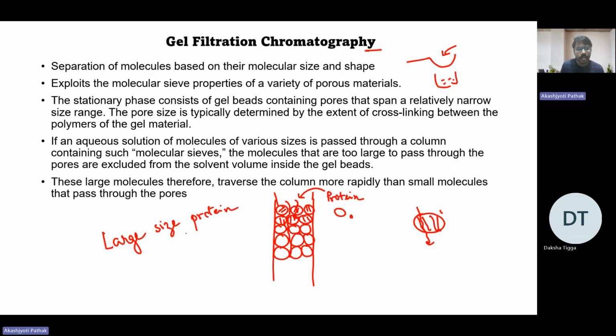Large size proteins are eluted first, and the small size proteins are eluted later.